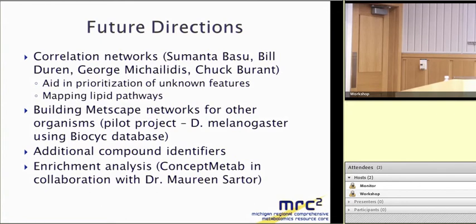So can you export the data to omics right now? Can you export your data to the omics tool to visualize it, from one tool to another? Well, I don't think you need to export it from our tool to their tool. The reason for that is that most tools will take a tab delimited file, and your data initially is probably laid out in columns and rows. So you can export data from our tool into a file and put it into their tool, but you are probably better off starting with your data set as it comes in, basically. Okay.